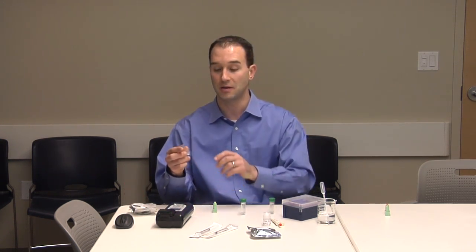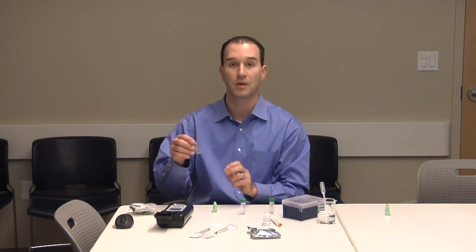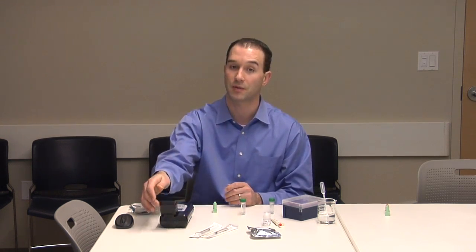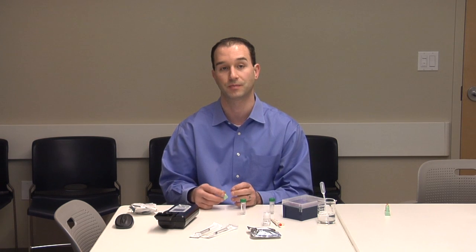Place the plastic cuvette in the instrument. The cuvette has an arrow which should face you when inserted. Insert the cuvette completely so that the fluorimeter lid can close. The fluorimeter and cuvette design helps prevent improper orientation.